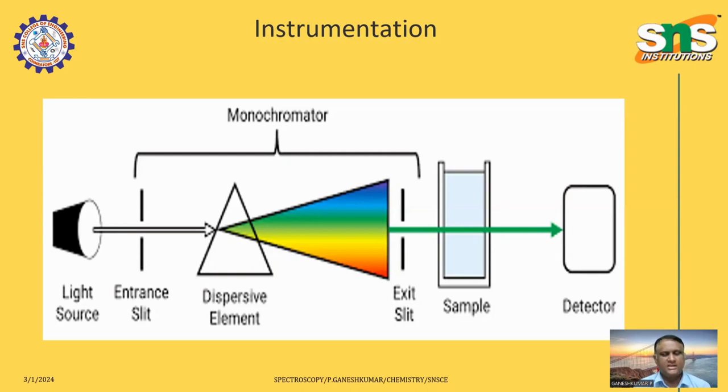Through this lecture series on spectroscopy, we discussed what electromagnetic radiation is, what the properties of light are, what happens when light interacts with matter, and Beer-Lambert's law, which is the basic principle of ultraviolet spectroscopy, and the excitation energy levels. And we have started with the instrumentation.